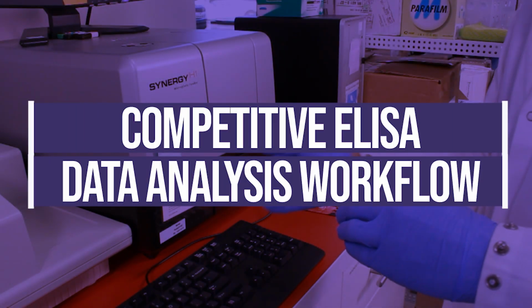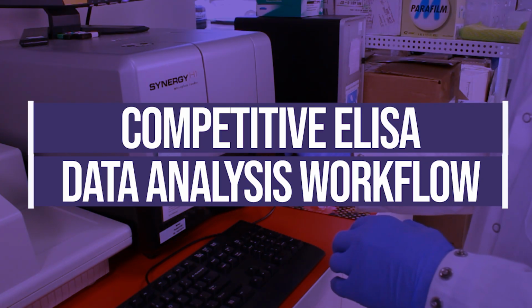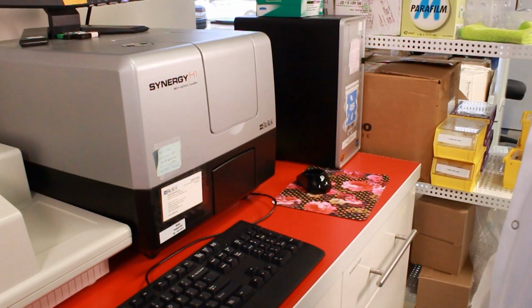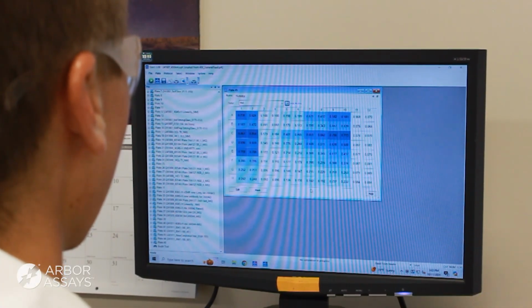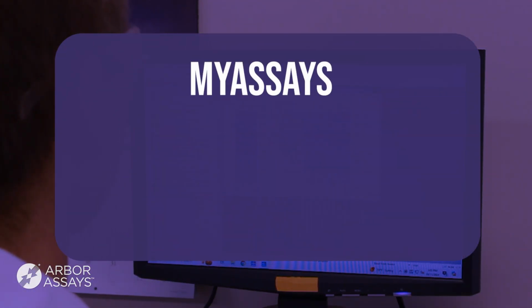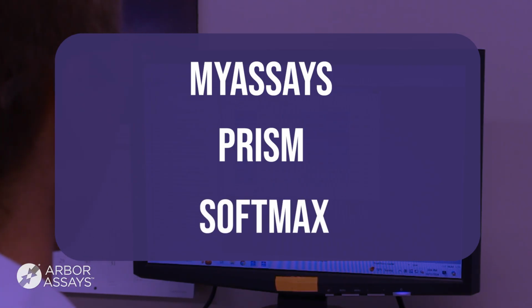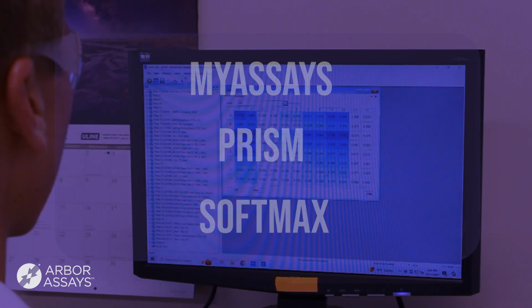In this video, we will review how to analyze your competitive ELISA data. You will need your data generated from a plate reader and software capable of fitting 4PL data. We will begin with the MyAssays online tool, then Prism software, then finally Softmax software. Feel free to skip ahead to the instructions for the software you intend to use.